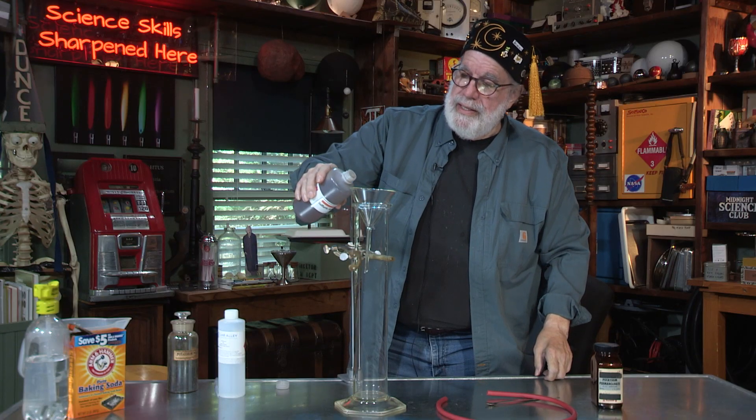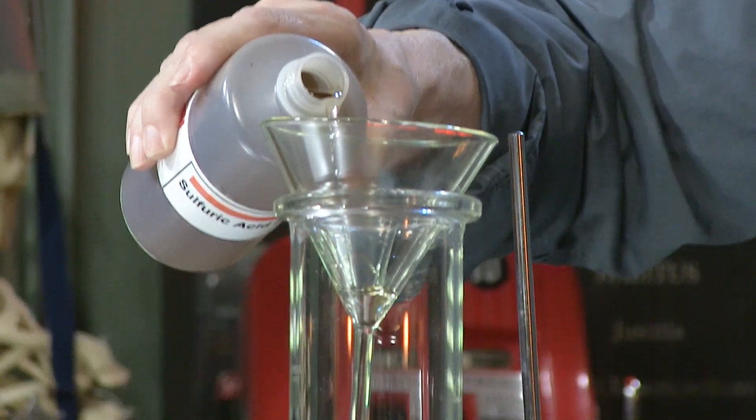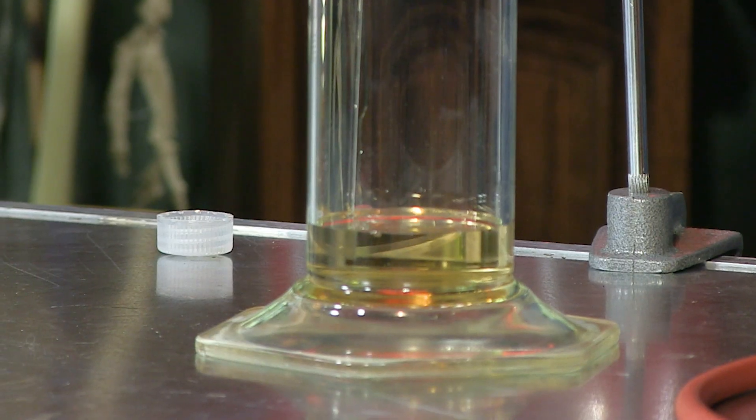So I'm going to pour some sulfuric acid in this. See how syrupy that acid is? That means it's strong and mean stuff.